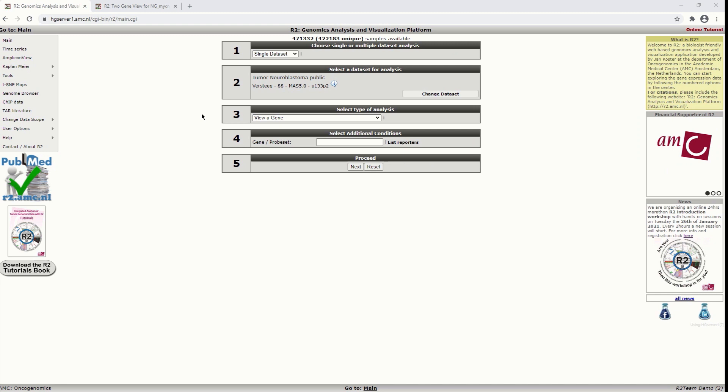In this video we are going to look at the differential gene expression between groups. We will have a look at two different modules that are a useful first start.